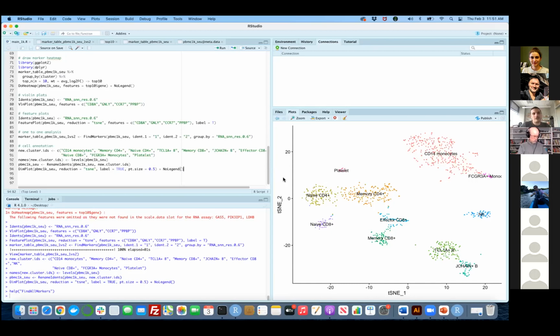And we do that all the time, by the way. I mean, it's not like we start with all the cell types in the body. Sometimes, most of the time, when we are just interested in CD3 T cells, we just sort for CD3 and prep the library, and we only have T cells, and we pick apart which of those T cell subtypes we have in our analysis.